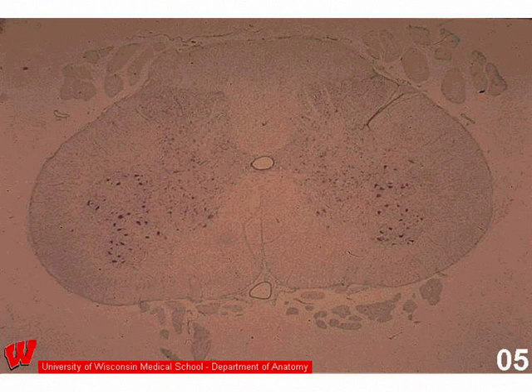The first slide we'll look at is a very low magnification light micrograph of the spinal cord. You can tell it's low magnification, as we learned about in the cell biology lab, because you can't see any cellular detail. The small dark spots that you can see in this more central portion of the spinal cord are not nuclei, they are in fact cells. So that's what makes this such a low magnification micrograph.